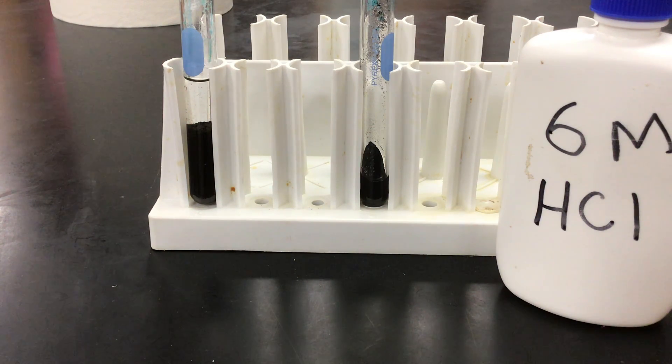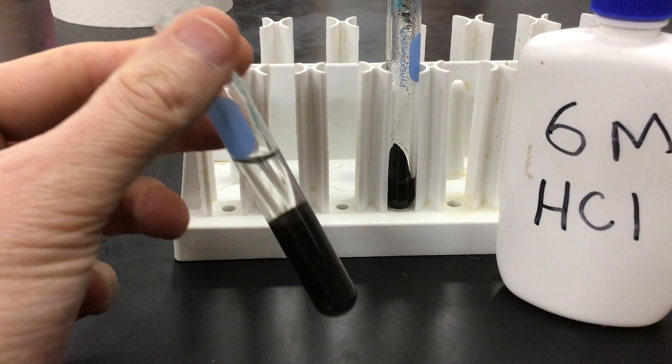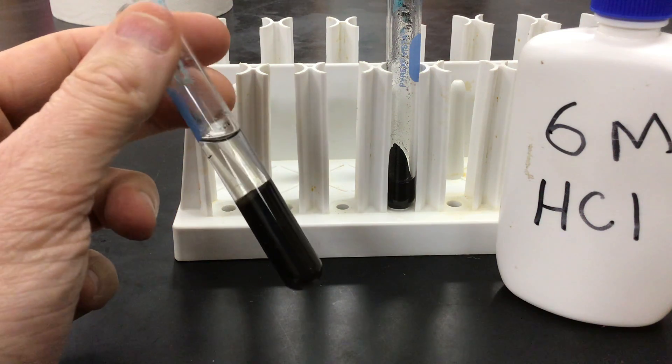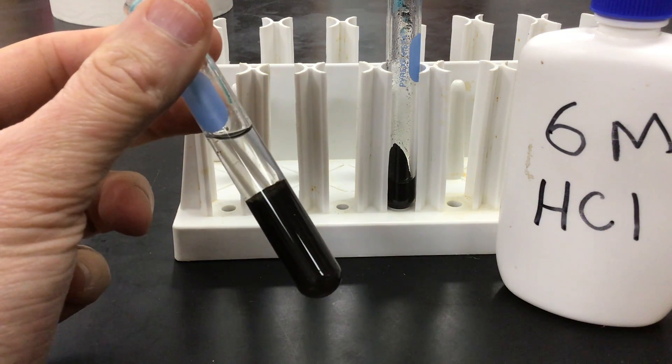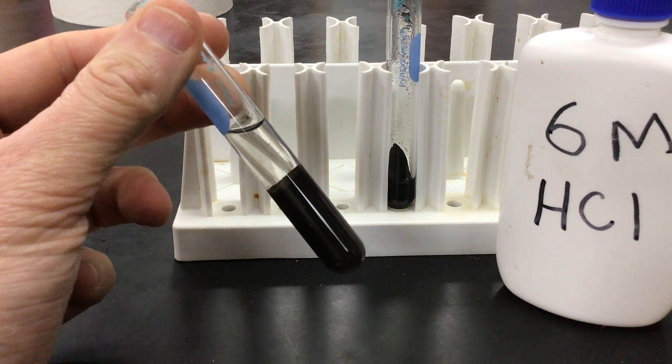In step four of the Copper Again Lab, at the end of step three, we were left with a test tube that, after putting it in the hot water bath, the solid changed from a bright, dark blue to black.